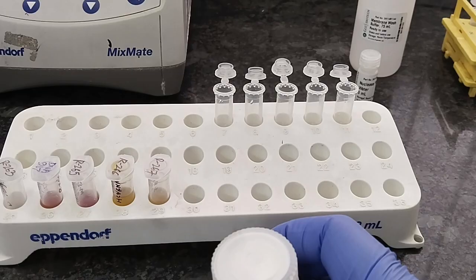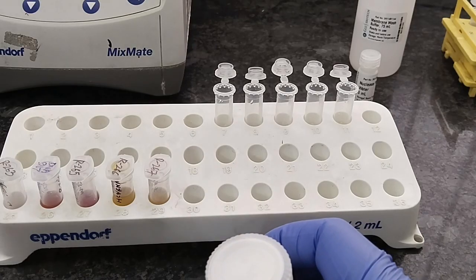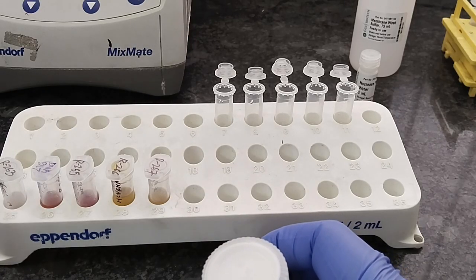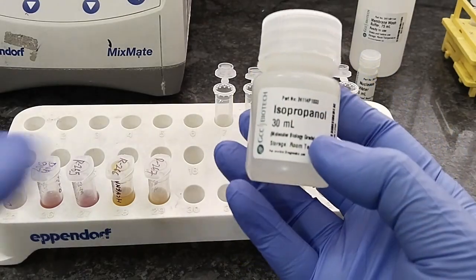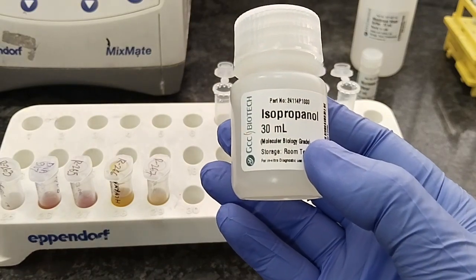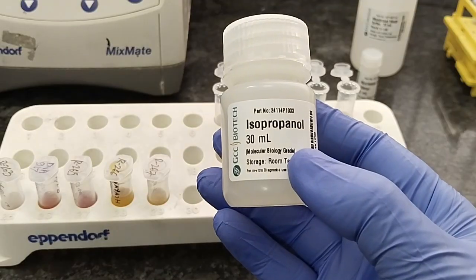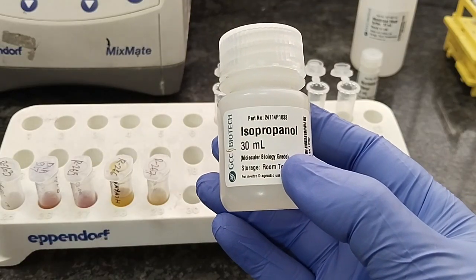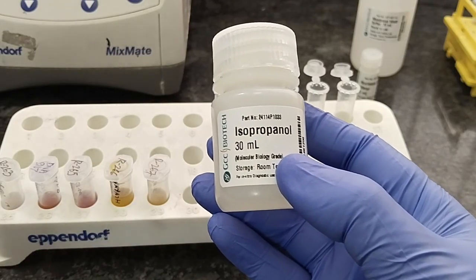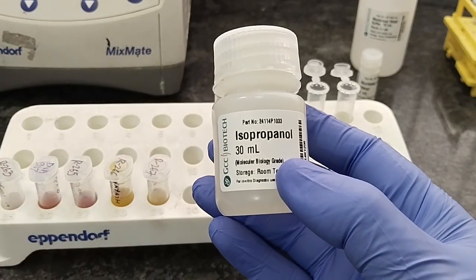So if RNA is soluble in water, then we have to precipitate it out. In both RNA extraction and DNA extraction, we use alcohol to precipitate the nucleic acid. So here we use isopropanol to precipitate out the RNA. Alcohol makes the RNA precipitate in the matrix.